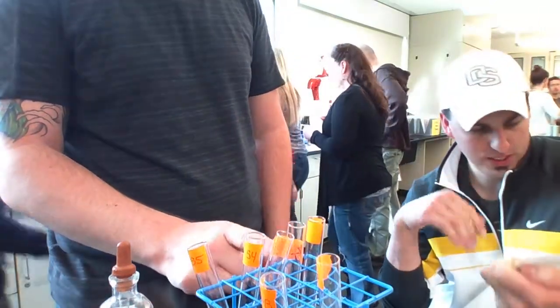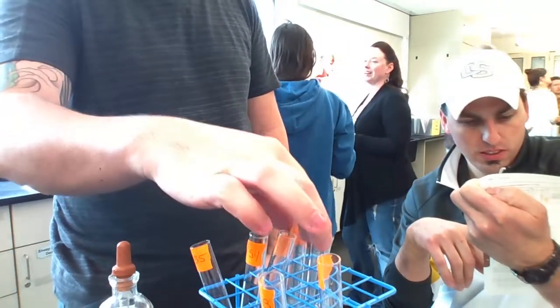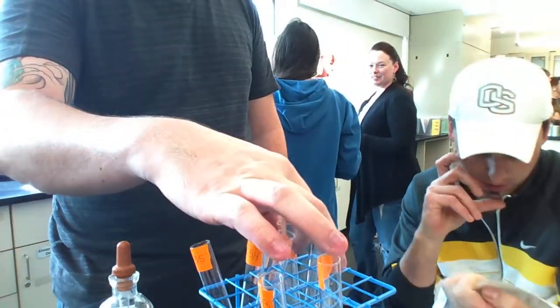Tube 2 does have litmus. It doesn't have anything in it yet. Okay.